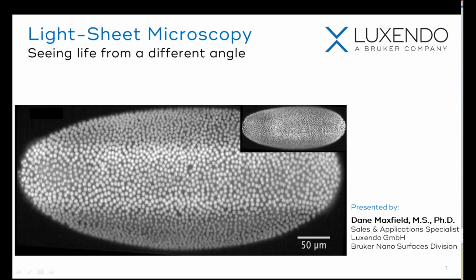In today's webinar, I'm going to be introducing you to lightsheet microscopy, going through the common setups that are presented out there, and then presenting some applications data from each. My hope is that by the end of this presentation, you'll have a better understanding and appreciation for this technique and how it can open some doors for discoveries of your own.